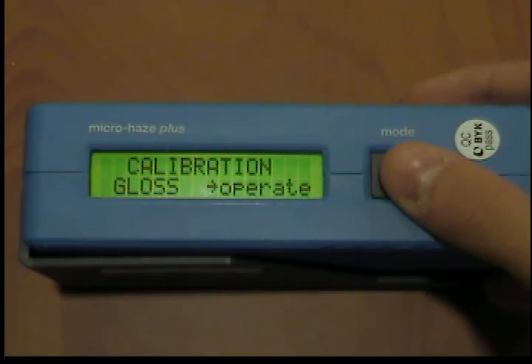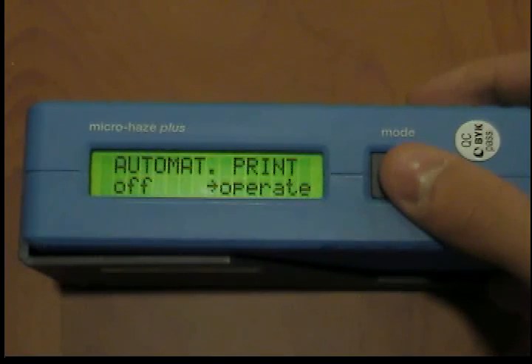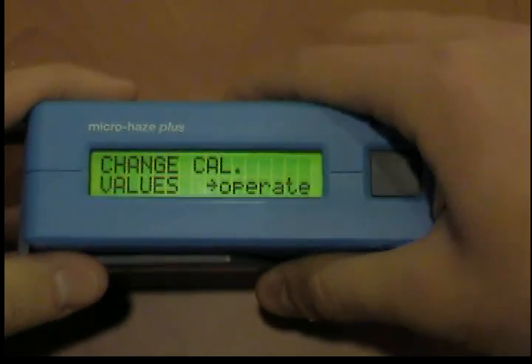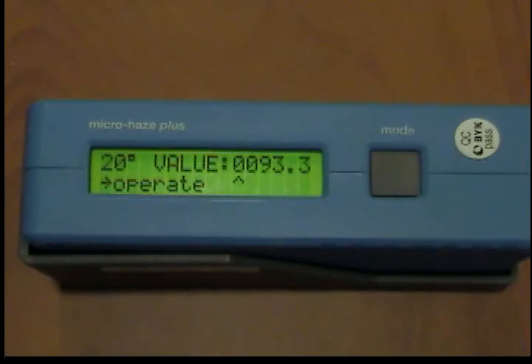The function change calibration values serves to enter new calibration values. To calibrate the unit, push it into the holder until the stop. Now switch on the unit using the mode button by actuating the mode button several times. Skip calibration until change cal values appears. To protect data against unintentional changes, actuate the operate button five times to switch into the change routine. Change cal value 20 is now displayed. By pressing operate again, the currently stored calibration value for 20 degrees is displayed, with the first digit marked by an arrow.